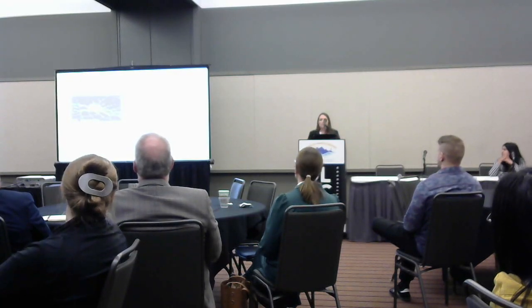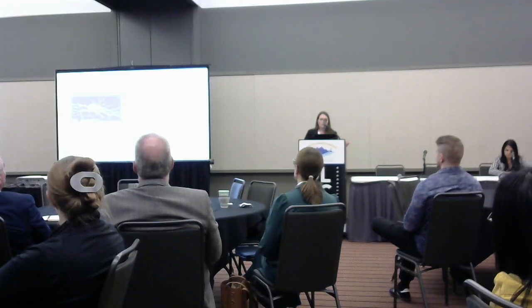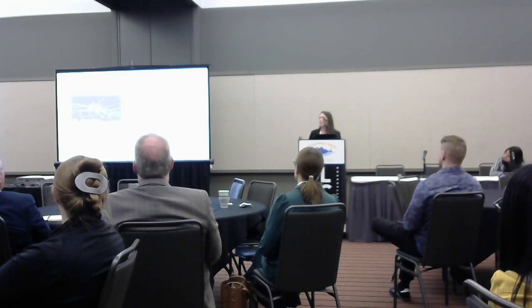The required computation. So here, three-dimensional segmentation. There are several software packages that do that, including ImageJ, CellProfiler. Python does a great job at that. Imaris does a good job at that. But things like QuPath, probably not where you want to go.